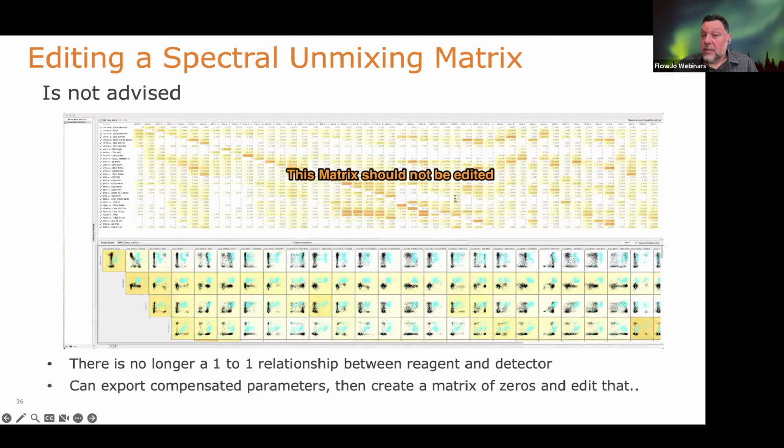One more question. What does the spectral option do for the compensation? Why would one opt for spectral compensation? Oh, that is the million-dollar question. I don't think spectral is the solution to everything. Sometimes traditional is just easier, right? You have fewer detectors to worry about. You're only taking a sliver, so you have less error compounding into the matrix calculation and less spreading.